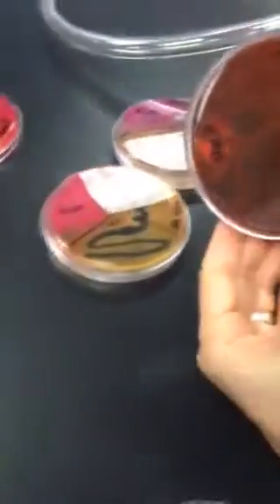That means they're strong lactose fermenters. They love lactose. They're taking it up out of the agar, and when they do, they turn color. E. coli is distinctive because it produces the metallic green shiny colonies, and it's a very strong lactose fermenter. But other enteric bacteria that ferment lactose will also take up the lactose and the dyes. They just don't turn shiny green.